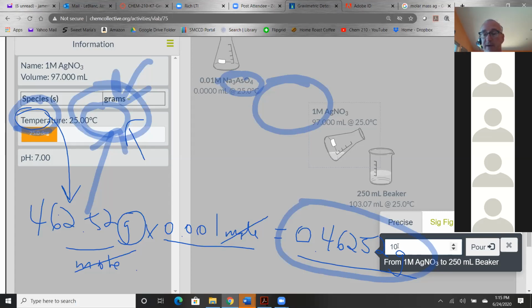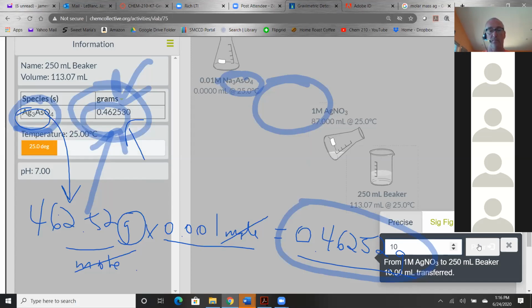The question is, am I going to get any more precipitate product? Yeah, I mean, the volume will be more, but will I get any more precipitation product? No. No. People seem to think no. Well, let's try it. This will prove it, right, to see if we get any more. So I'm going to add 10. And let's have a look.